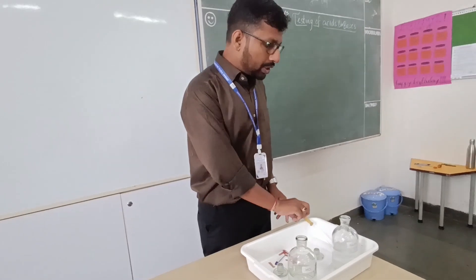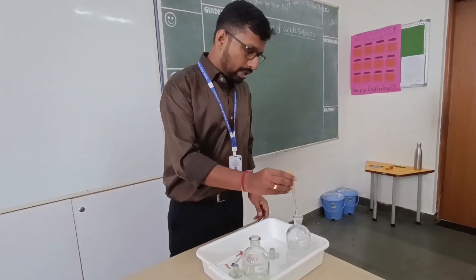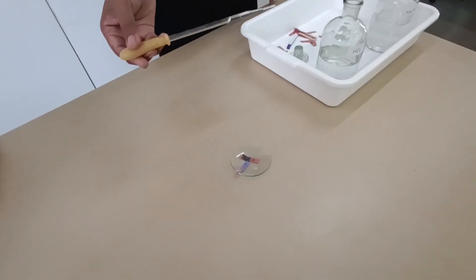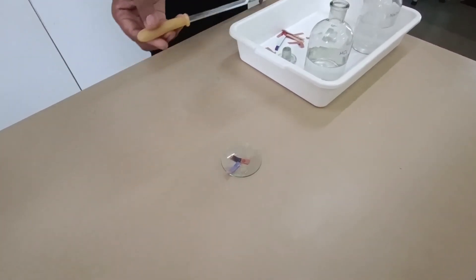Now if I put a base on the same litmus paper, should it again change the color? Let us check. If I put a base onto the same litmus paper, it will again change into blue color. Can you see? It has again changed into blue color.